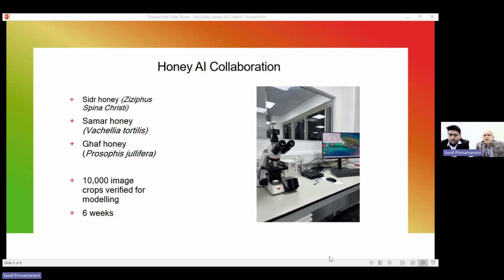Then I optimized as per the regulations of HoneyAI because I need quality data. We optimized using acidified water and some temperature controls, to remove the dirt coming from the field, from the honey extraction. Then we were very happy and we optimized the procedure technique, including the density of the pollen.